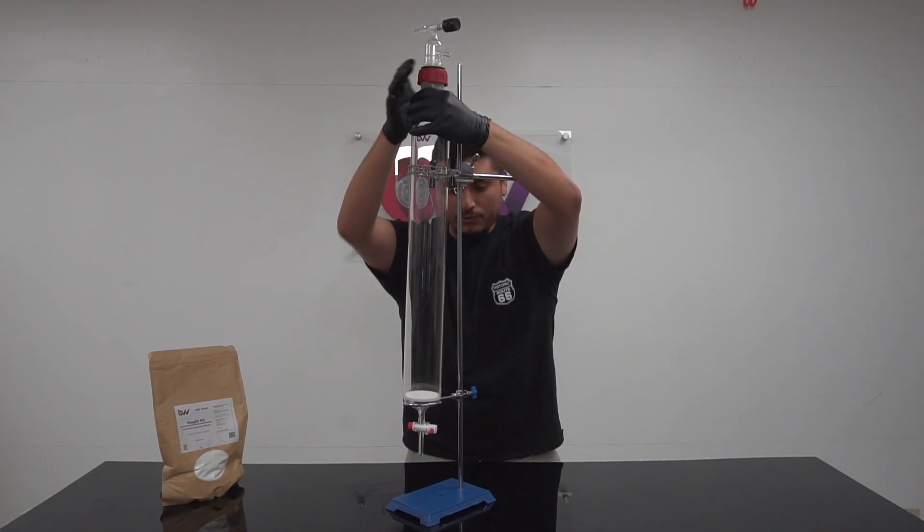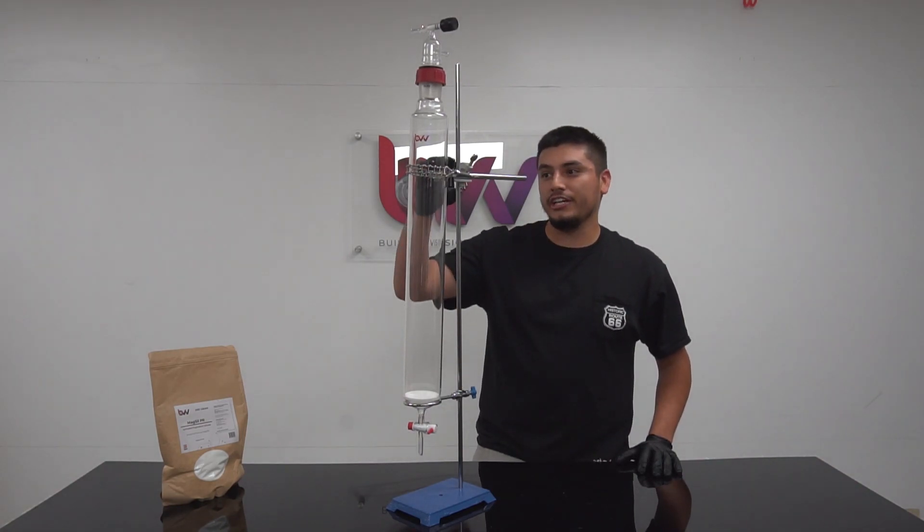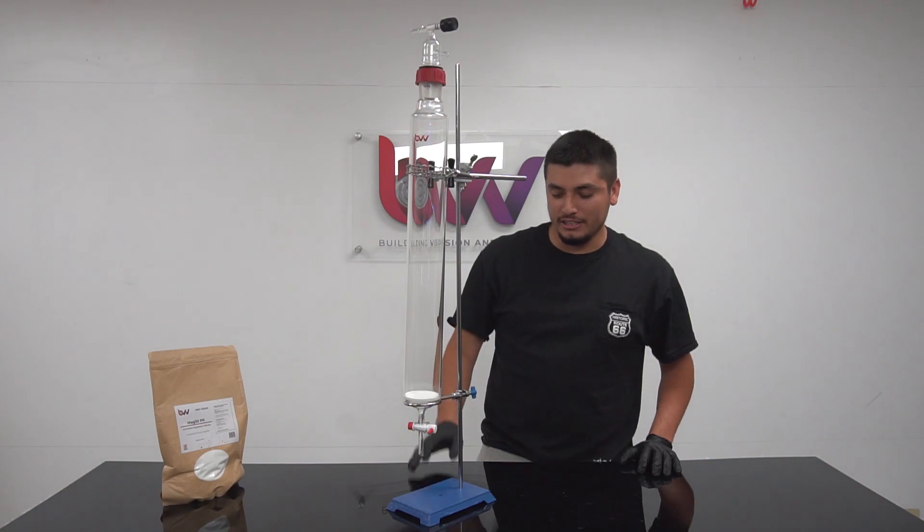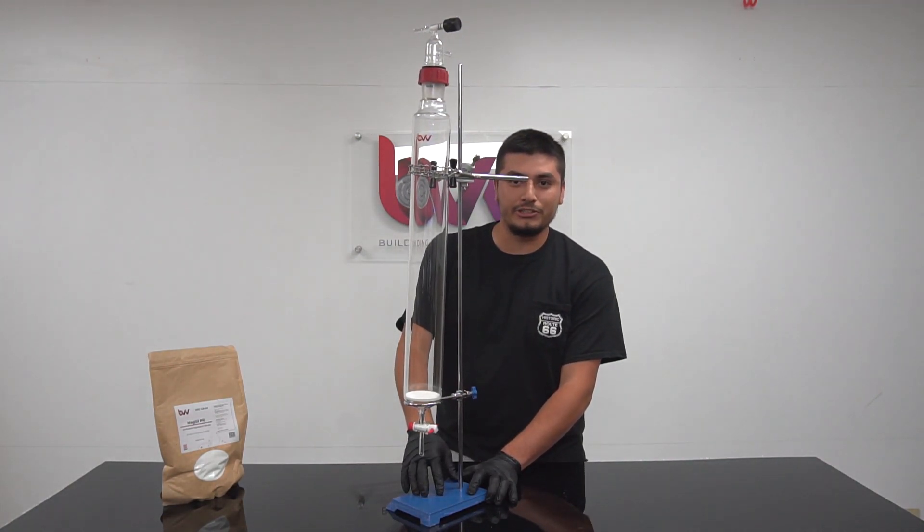Also coming with the kit will be our support ring and chain clamp. It features a 36 inch rod as well as a casted iron base for better support.